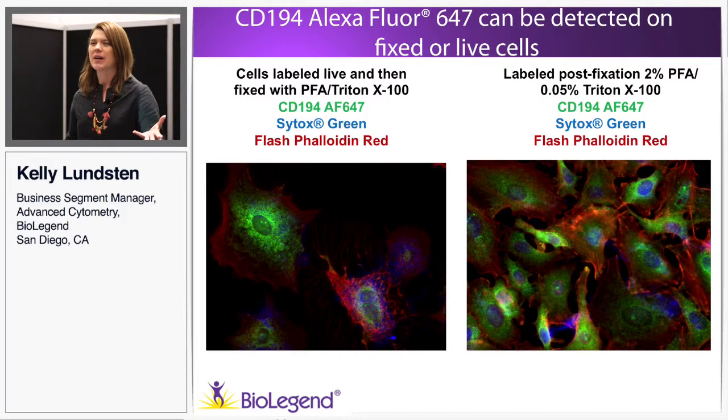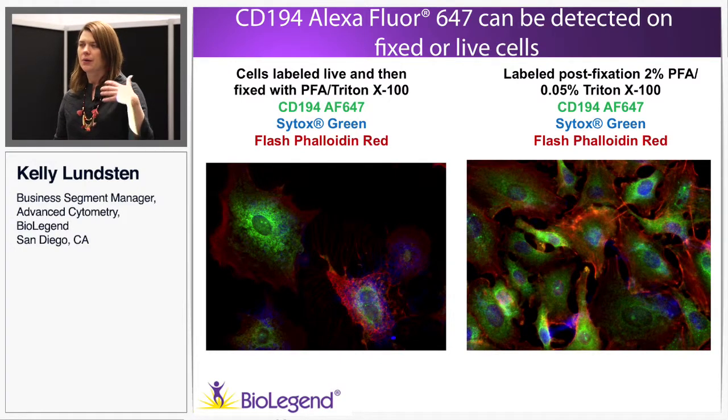One of the questions was, fixation can also affect your chemokine receptors. And it's a general question of immunology in using a microscopy platform as well. Do you have to label live like we do in flow? Or is there the potential that we can fix, perm, and add the reagent and get identical results? And that's absolutely not going to be known for any of these receptor antibodies.